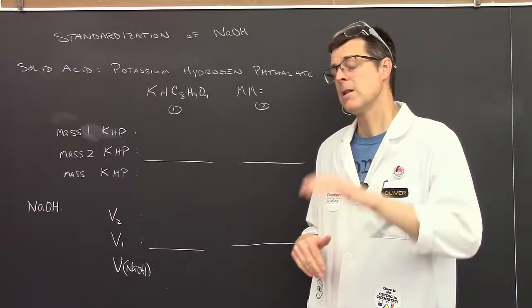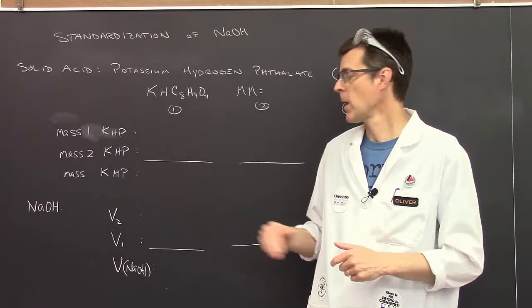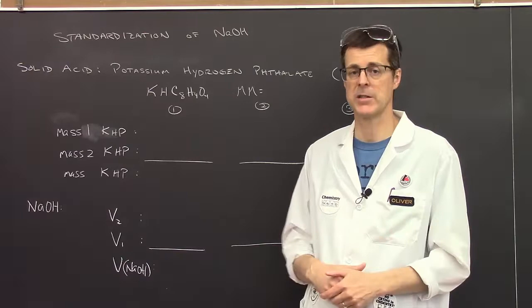Then I'm going to titrate using sodium hydroxide, where I will find an initial volume and titrate to the endpoint and find another volume. That will tell me how much I've used. I'll show you some details as we go through.